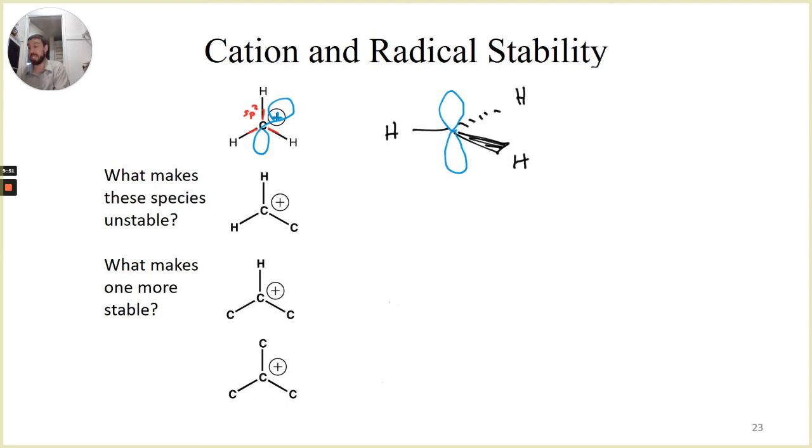So we're turning the molecule so that we can see that a little bit better. Okay? So that hybridization, not super critical to our argument here, but we need to be familiar with that shape, because when we talk about cations, you need to be familiar with the shape so you can predict its reactivity.